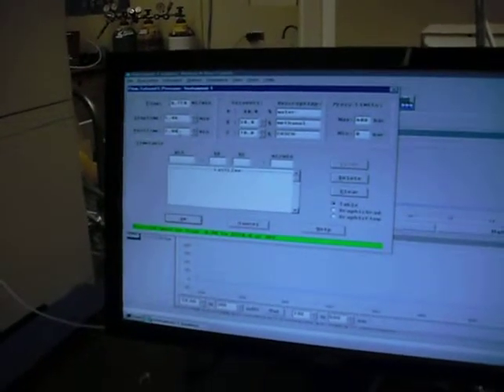A long post time is needed when you do solvent gradients, because one of the Achilles heels of solvent gradient processes is that the column actually has some kind of slow equilibration with the mobile phase. So if you run from, say, 30% organic to 80% organic over the run, then you start the next run and you want to start at 30% organic again, you need to just run 30% organic for, say, 5 or 10 minutes in order to re-equilibrate the column with the new solvent composition. So that's a little caveat.